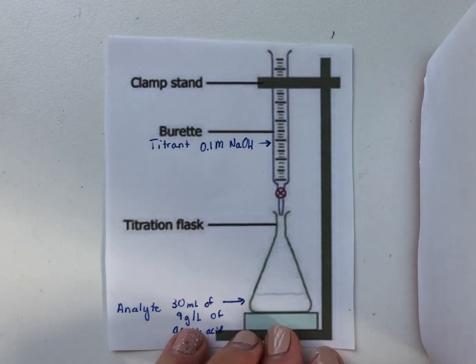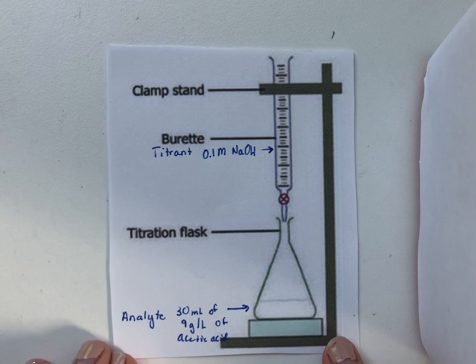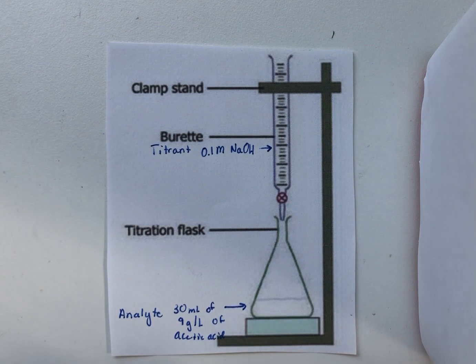So to start, our setup is a titration. So in lab, we would use butterfly clamps, and that would give you the option to have 2 burettes side by side with 2 titration flasks. But for this lab, we're only doing it once, so that's why I went with this image.